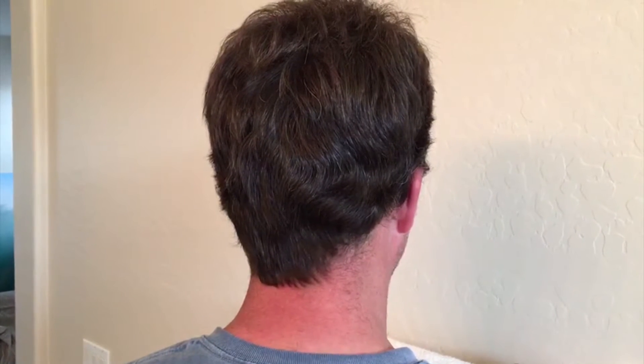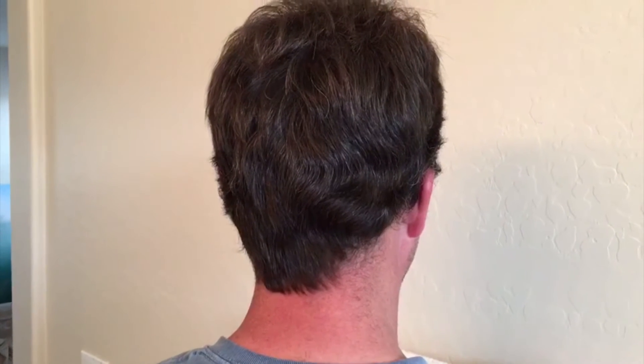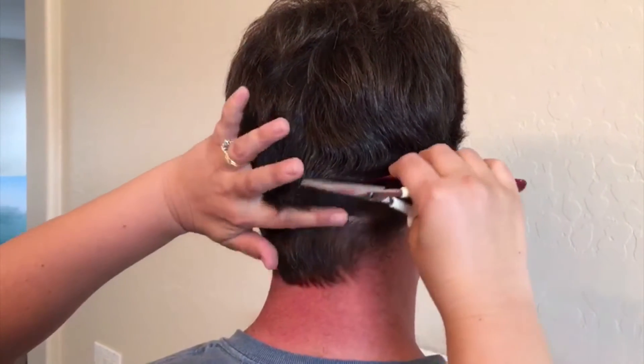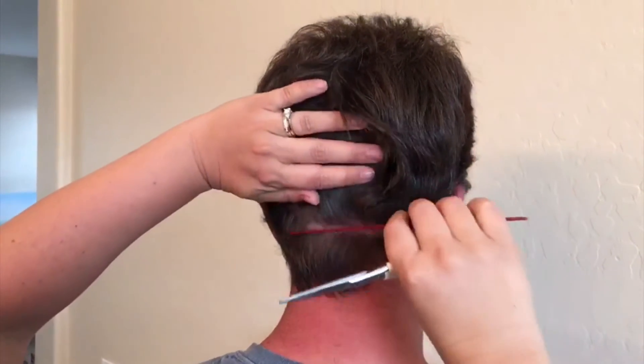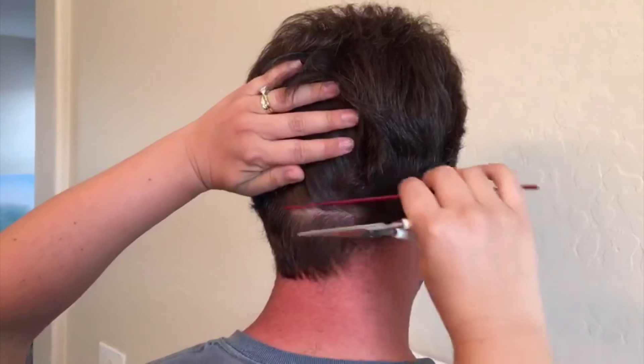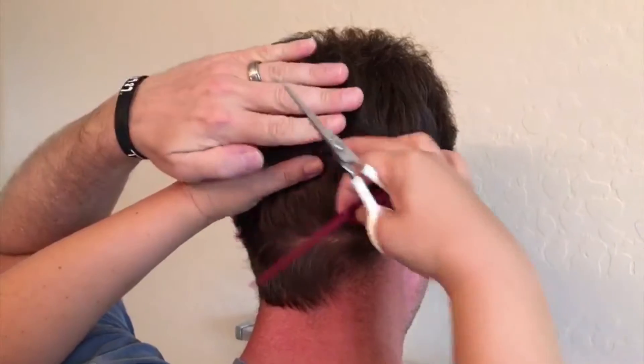Today I'm going to illustrate how to collect a hair sample for a person with a short hairstyle. We're going to start close to the bottom, or the nape of the neck, by sectioning up a line of hair. You'll probably want a rat tail comb or something similar to do this. You can use a clip or the person's hand to hold the hair up.